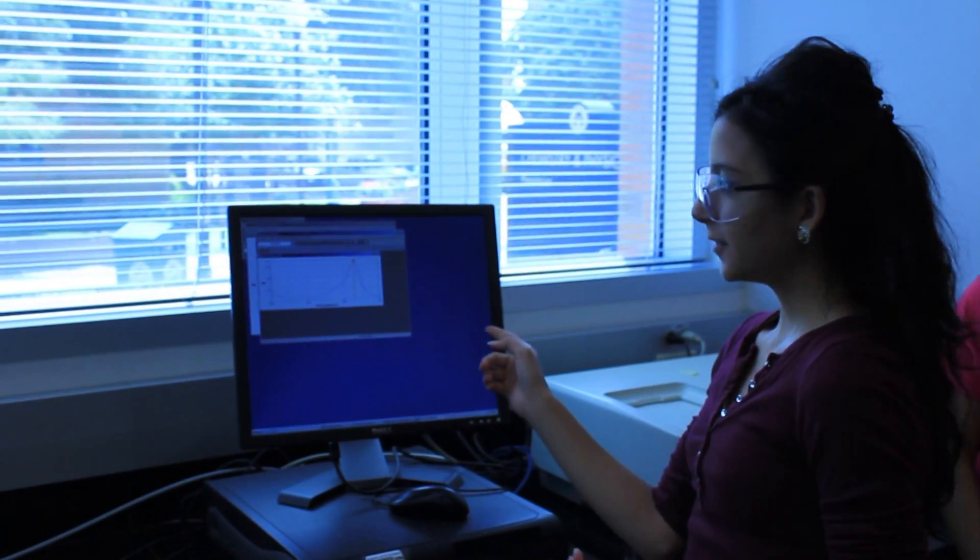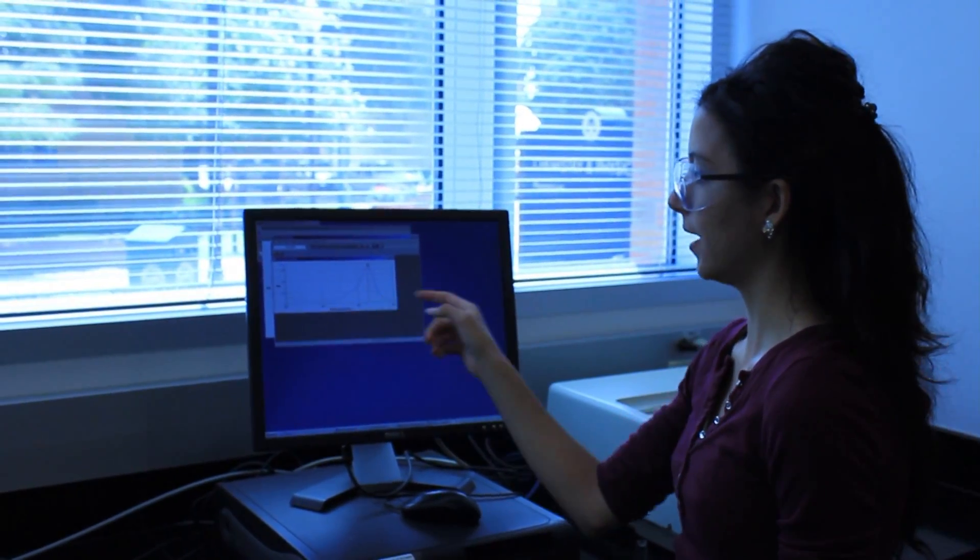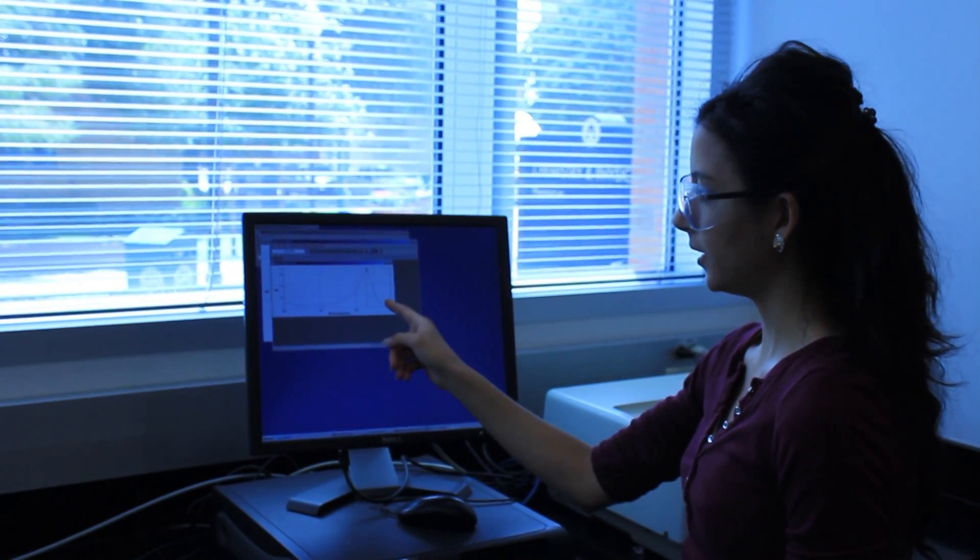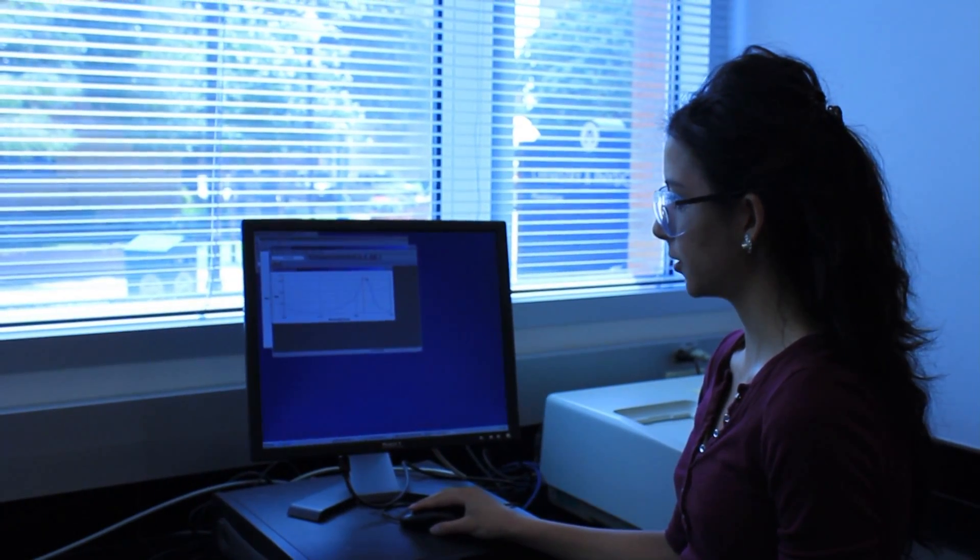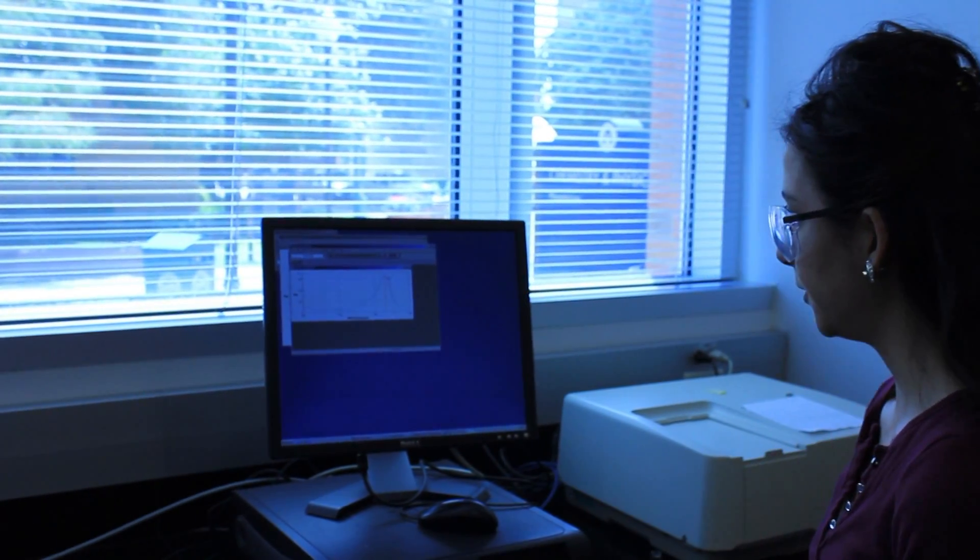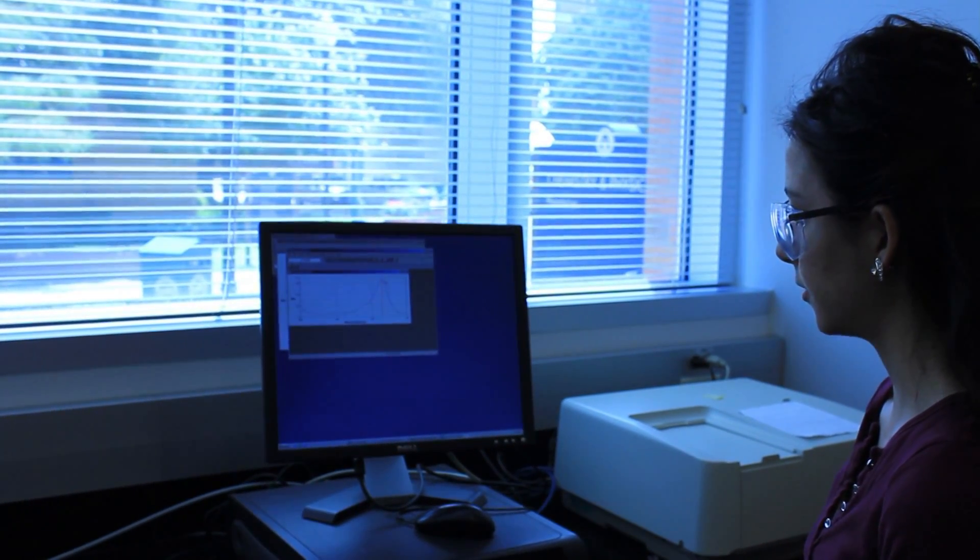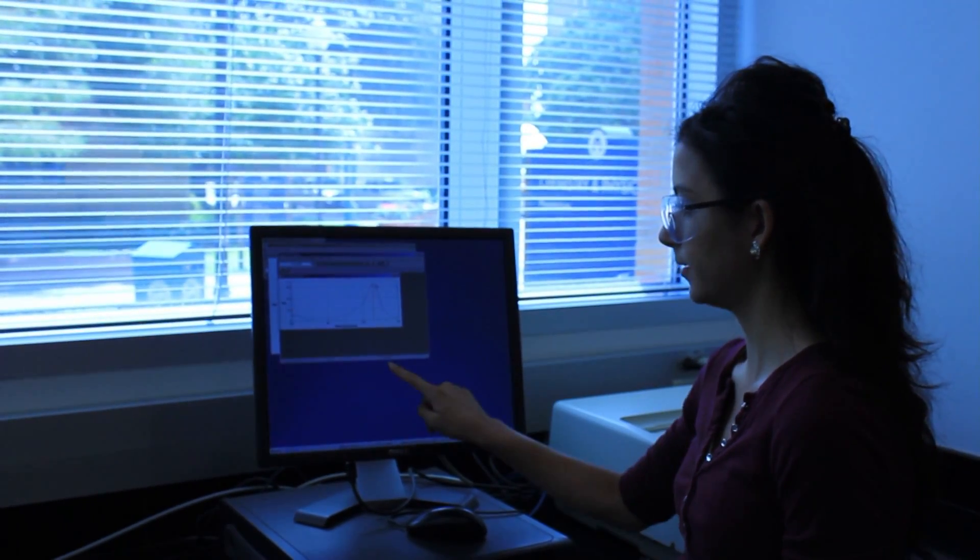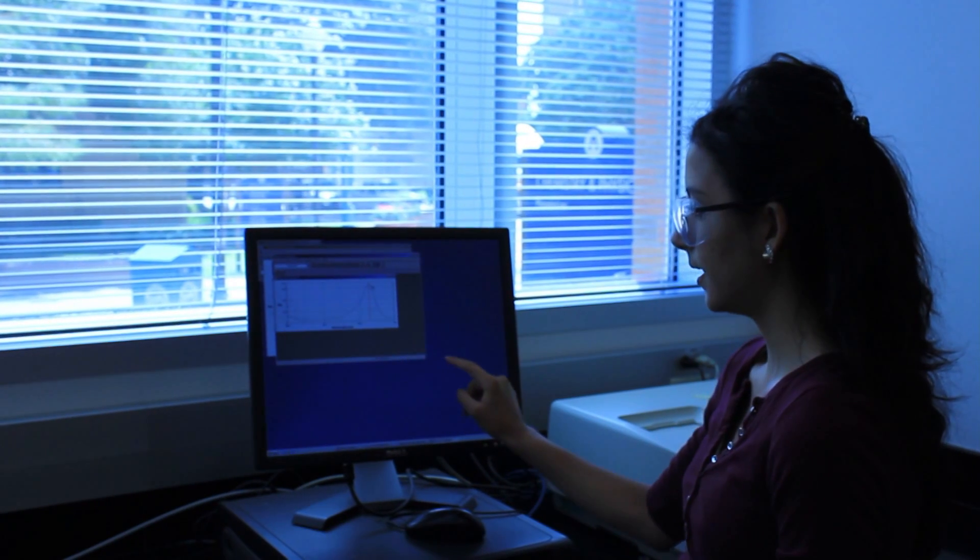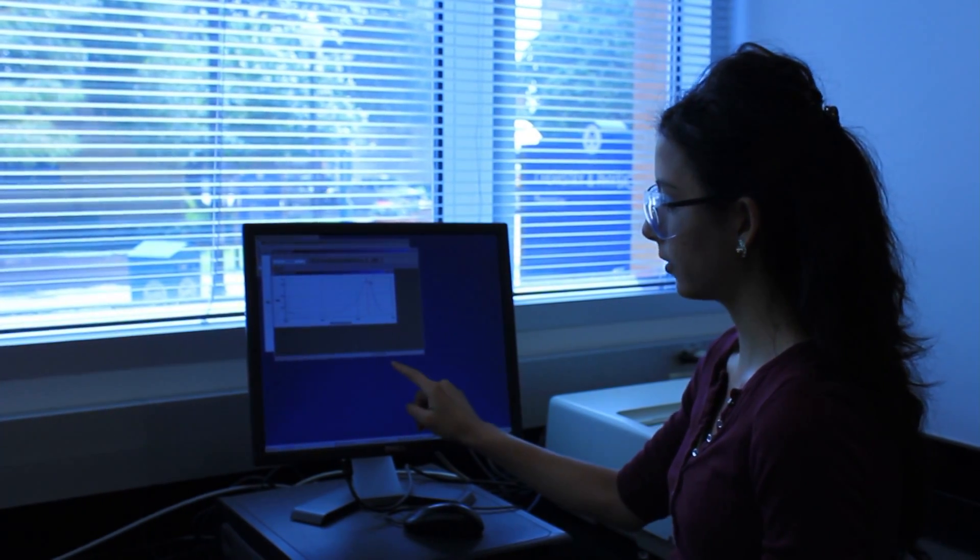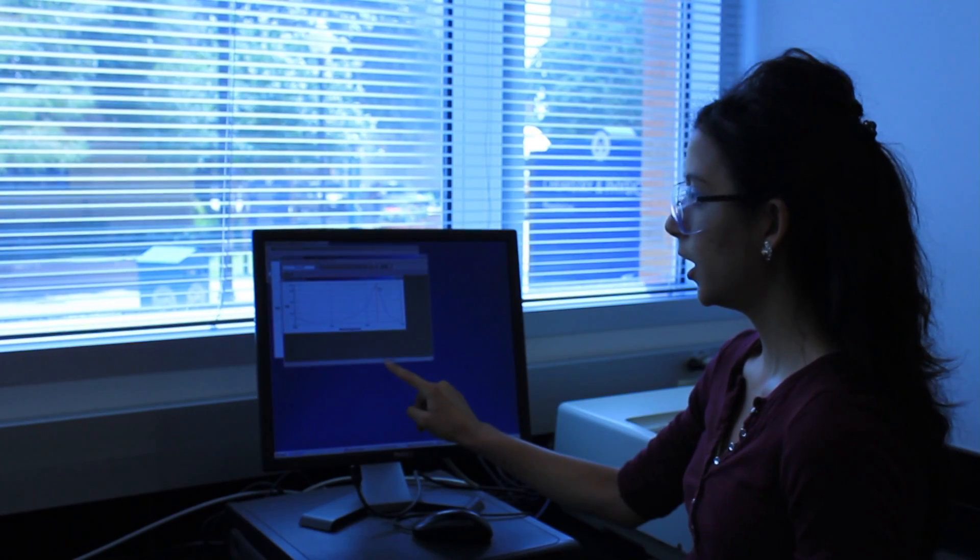Once it's finished measuring this window pops up with a graph and you go find your peak of your graph and you just click on that region. So you click where it looks highest which is around here and you can either use your arrows or just go forward and backwards to find your highest absorbance which in this case is 0.65706 and that happens to be at the analytical wavelength of 629 nanometers.